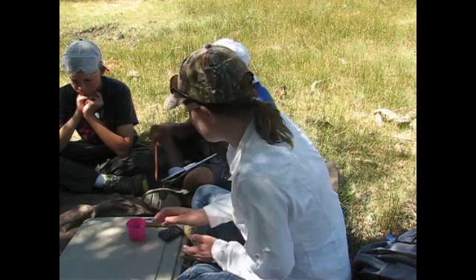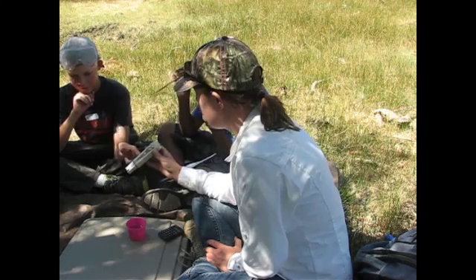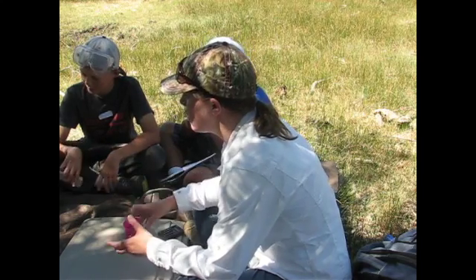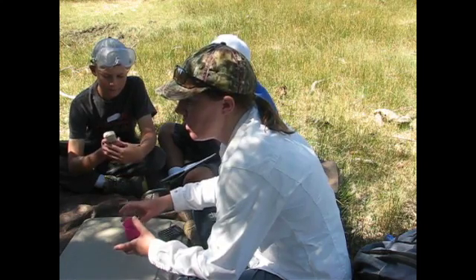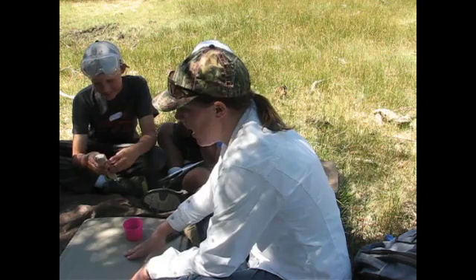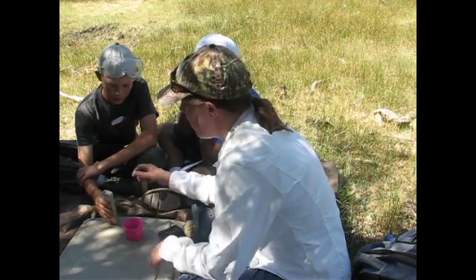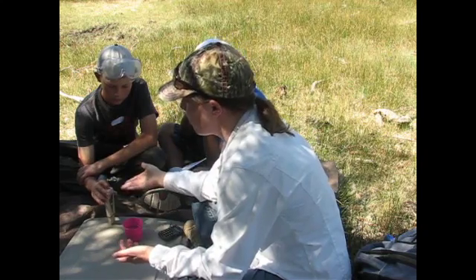Okay, so to measure total dissolved solids, we use this. Can I do it? Sure. Austin wants to do it. So water, when there's certain chemicals in it that have a charge. Troy, what do you mean when it has a charge? Like they have positive and negative qualities, and when you have them in water, they can create an electrical current or a charge, and that's what we're going to be measuring. So the more TDS you have, the more charge you should get, so the higher the reading.